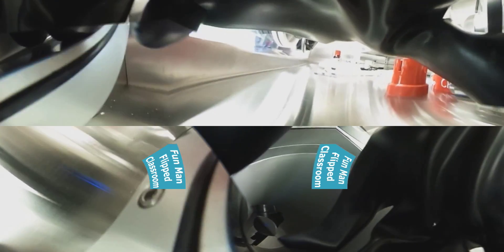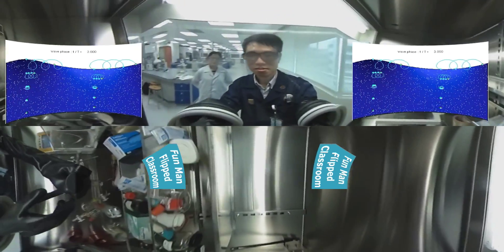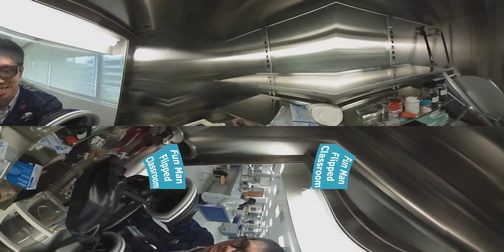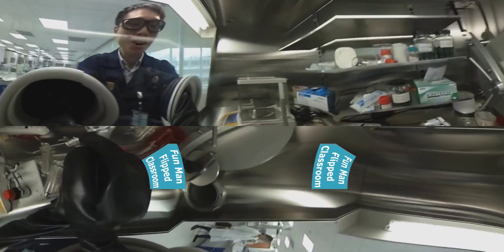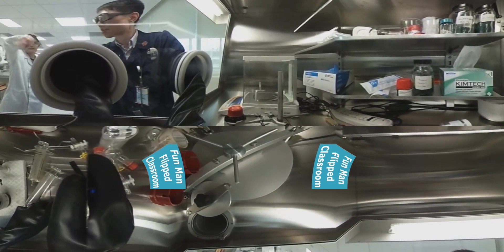All the way in — hear the sound — we are seeing the light. Welcome back. Carefully taking you out. Hello, wave! Now we are outside and the camera is inside. Check out how it looks — 360 degrees around the inside of the glove box. See the surroundings, see the gloves.